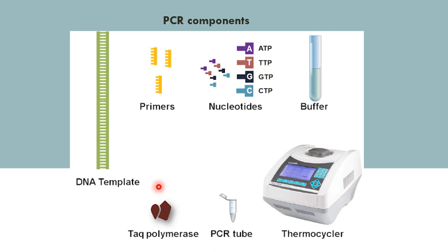Let's say you need a PCR that will finish within less time than the traditional one, so you need to optimize your reaction based on the characteristics of the enzyme you will add. For example, there are some rapid enzymes that will add more than 1,000 base pairs per 10 seconds, as the one we have mentioned before. It will add more within a shorter time, so the overall time will be reduced.